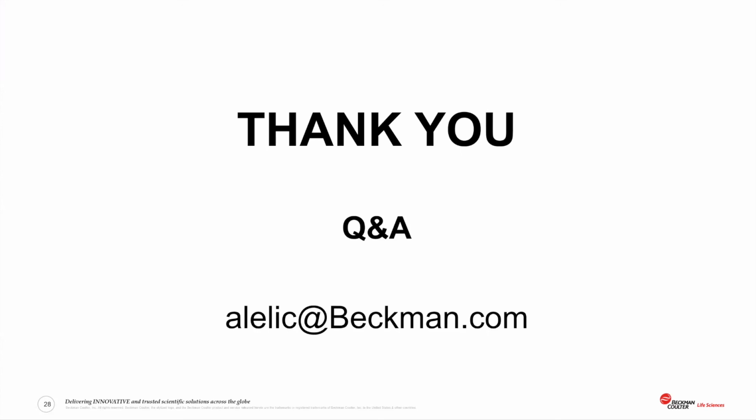Perfect, thank you. And then I actually have a personal question about compensation and modifying compensation and its impacts on rigor and reproducibility. So when we're taking a look at any of our data, I know personally we don't advise manual adjustments to compensation. So I'm wondering how you suggest checking that compensation, and how do you validate that that's reproducible if you make any adjustments there?